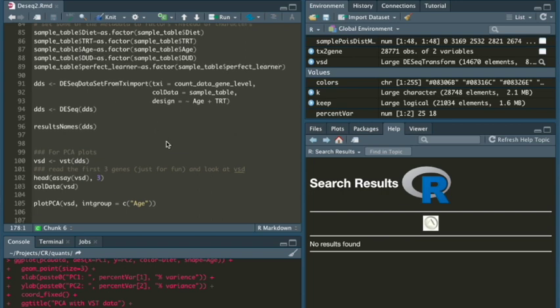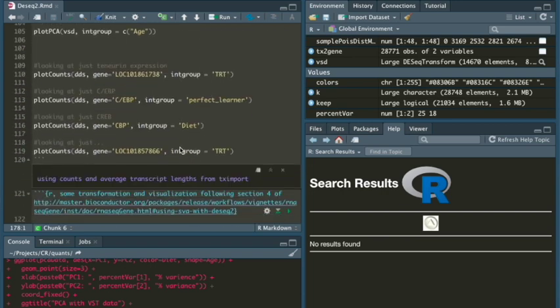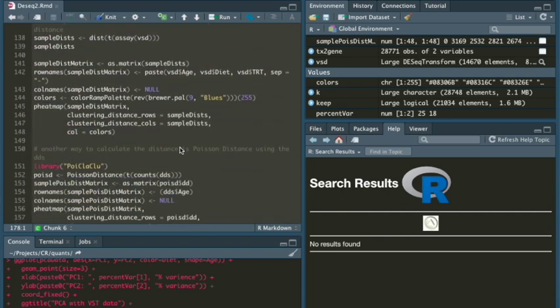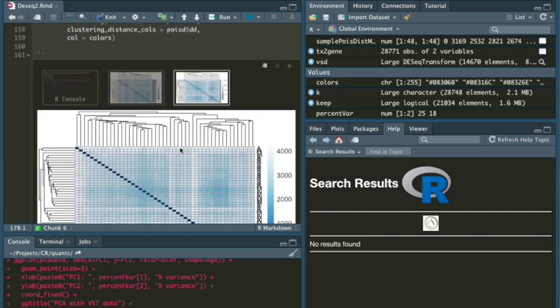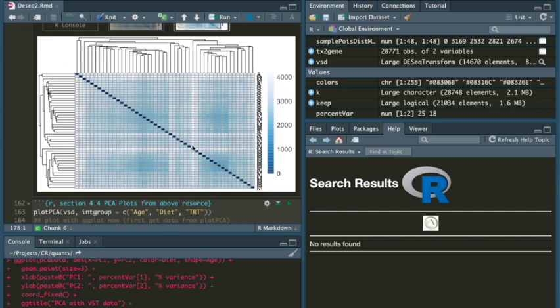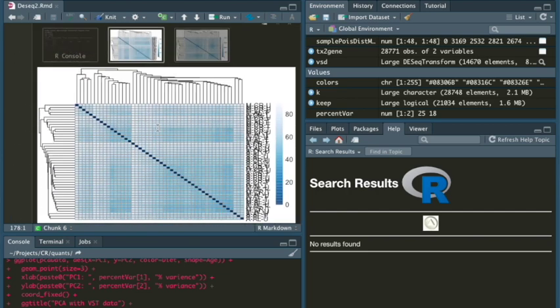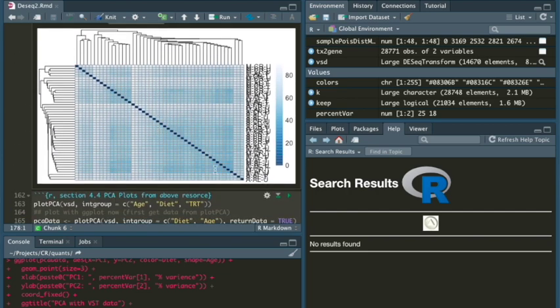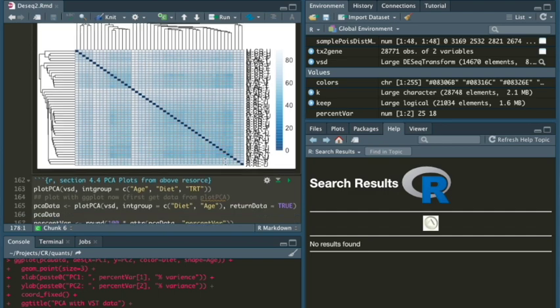All right, DDS. This is a DESeq2 function on my samples. So I was able to produce a heat map, which is really cool. Here goes the heat map for my samples. I was telling my advisor I was able to get this. I don't know exactly what this means yet. I need to do some more digging into that, but it looks pretty. And here goes my samples: mature, calorie-restricted, untrained, aged, ad lib, untrained, whatever.